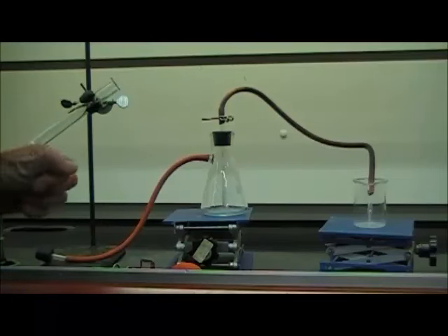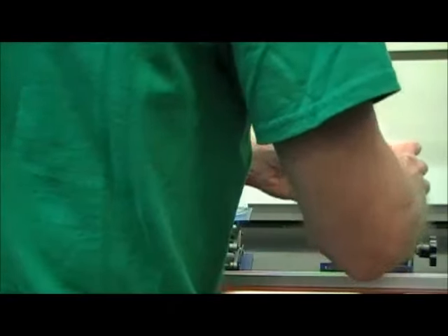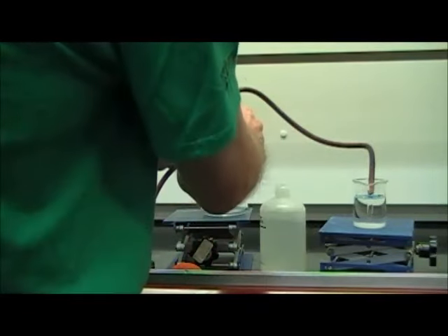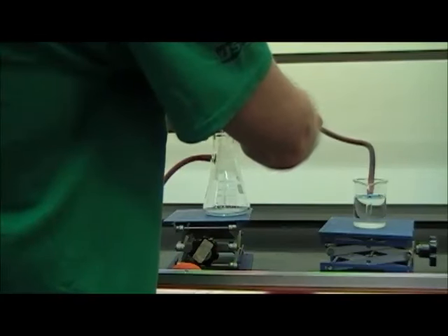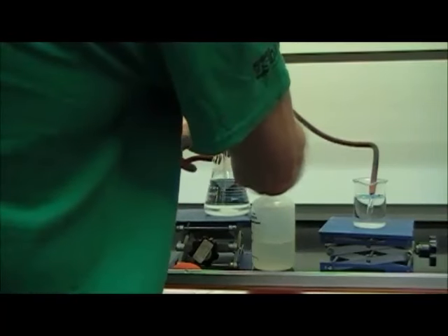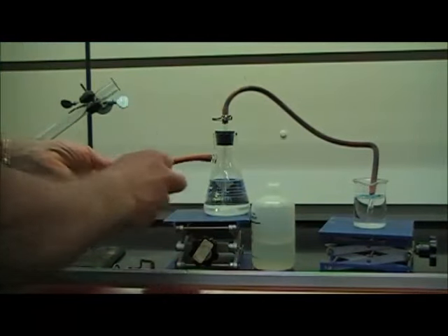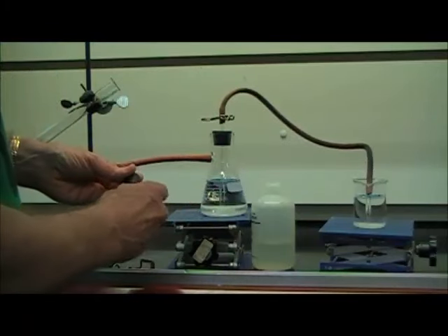In order to get started, we need to have water in both the beaker, so I'll just put some water in there, a fair amount, and also in the flask, we need to have a fair amount of water. Make sure the rubber stopper is in there tightly. And then what we're going to do is blow water from here over to there and then suction it back again using this suction device, which we'll just attach on the end of that.